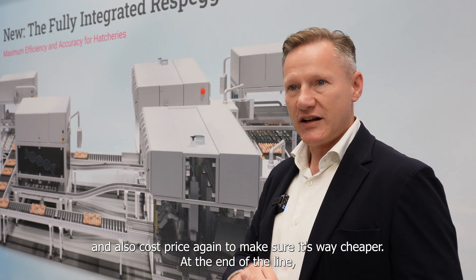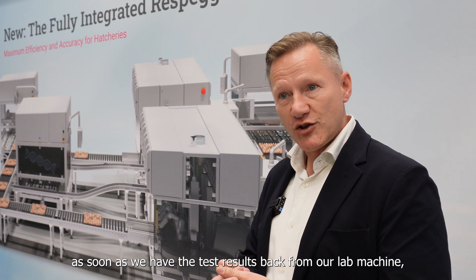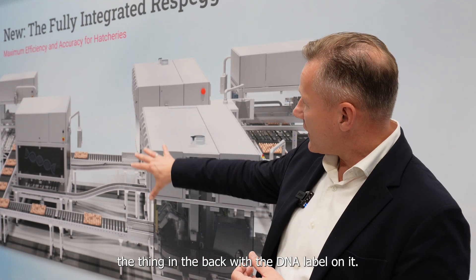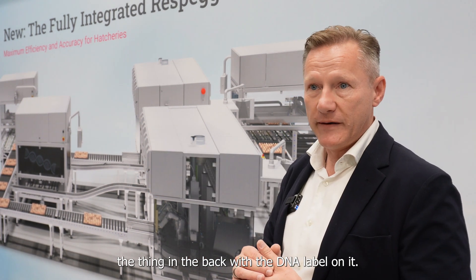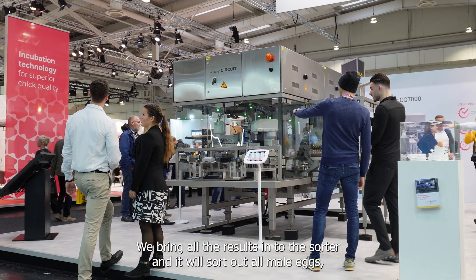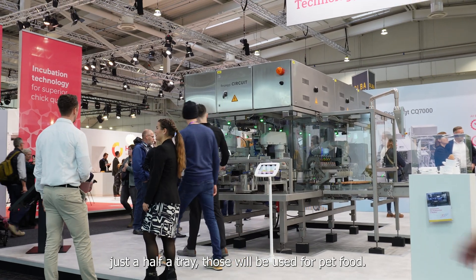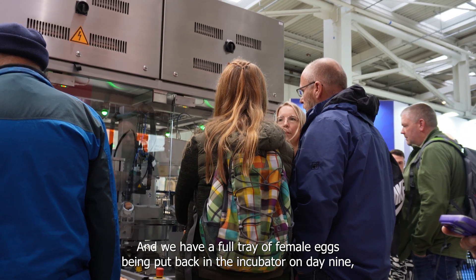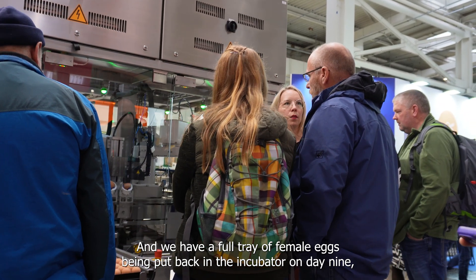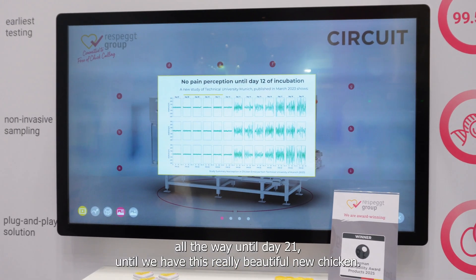As soon as we have the test results back from our lab machine — the thing in the back with the DNA label on it — we bring all the results into the sorter and it will sort out all male eggs. Just half a tray — those will be used for pet food. And we have a full tray of female eggs being put back in the incubator on day nine, all the way until day 21, where we have a really beautiful new chicken.